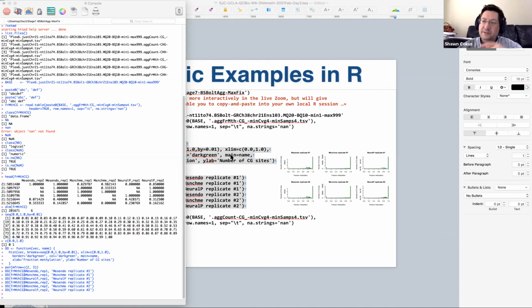So I wanted to see if we have a lot of big concentrations at very small integer fractions, right? Which would suggest that if you do your binning very coarsely, that hides it, and you may get a big bump in the middle, but it's really just the 1 out of 2s, and maybe you haven't filtered for denominators enough yet. So it's useful to start with a fine binning just to see if you've got any discrete integer problems.